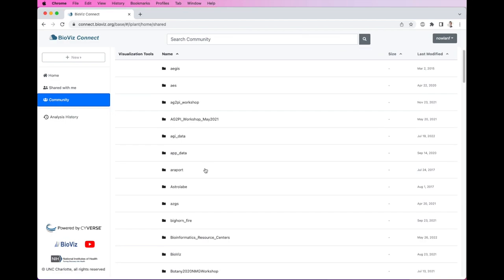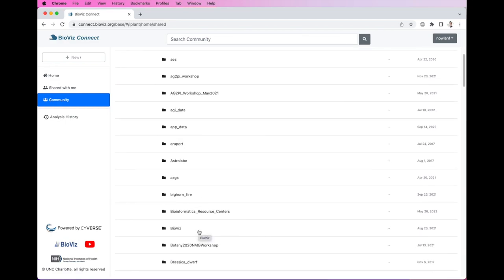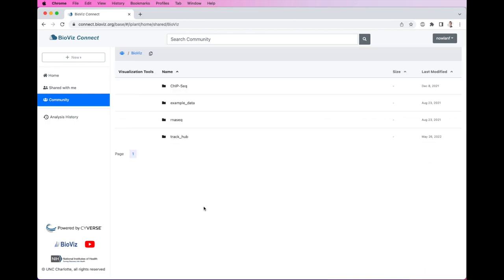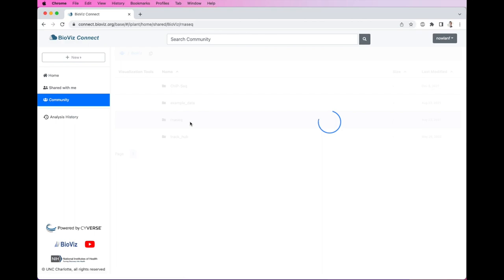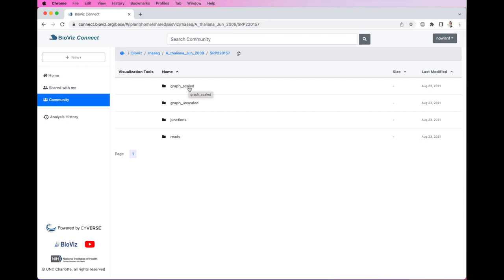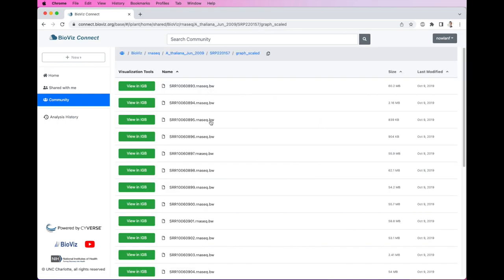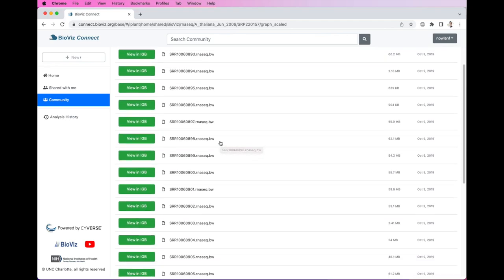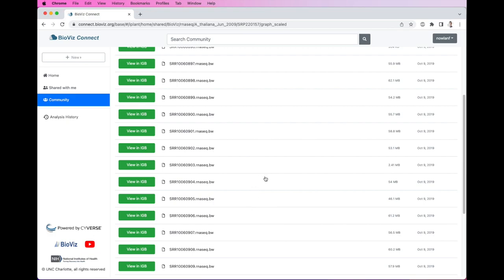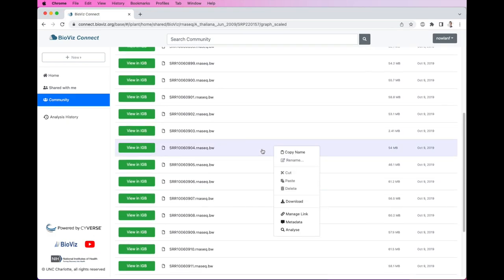We have our own BioViz folder with the data we will be working with today. The data are from an RNA-seq experiment in Arabidopsis looking at abiotic stress. We want to look at the scaled coverage graphs for the data as we are interested in differential expression for our gene of interest. Notice that the files have unique but not very human-readable SRA numbers for their names. If we right-click on a file, we get some options — such as renaming or deleting a file — but we also have BioViz Connect specific options. Manage Link allows us to create public links to files. The Analyze Link can be used to run jobs on files, and all of these scaled coverage graphs were created through BioViz Connect and CyVerse.